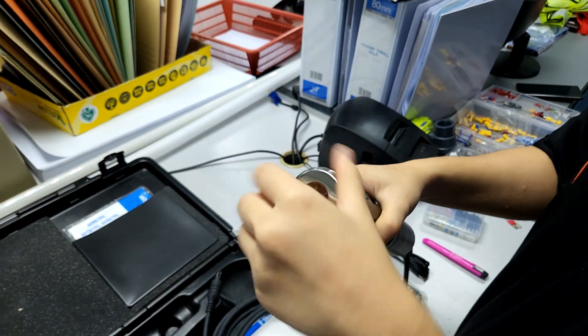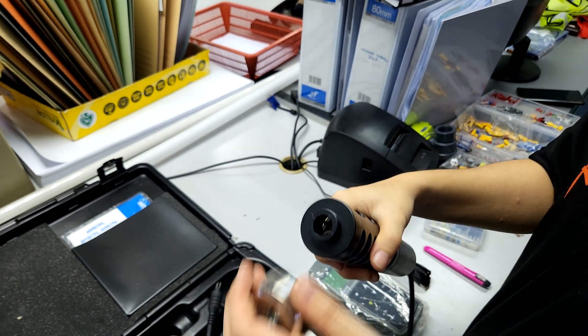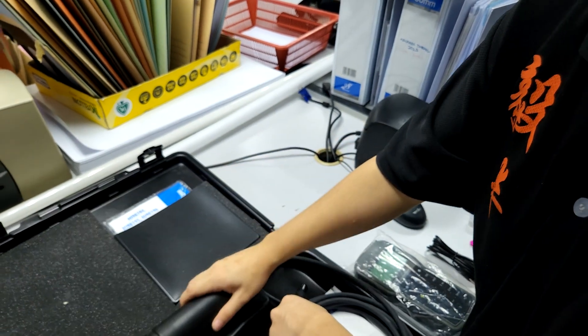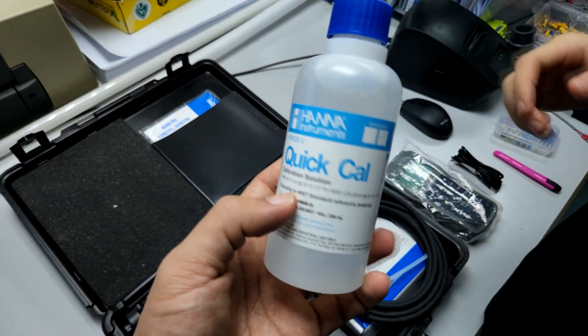One thing I like to do with this probe is to remove the sinker, which is a stainless steel part from the probe. What I don't like about it is that it makes the probe unnecessarily heavy, because most of the time the probe will easily sink to the bottom. I remove it to ensure the wires are not damaged.